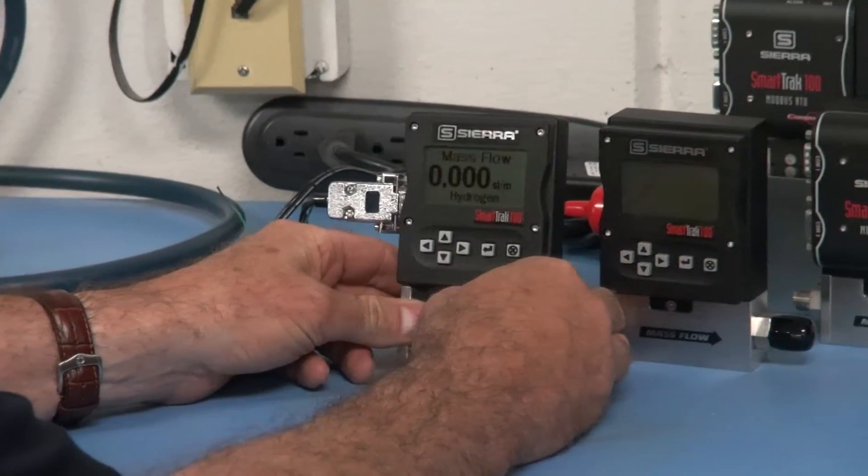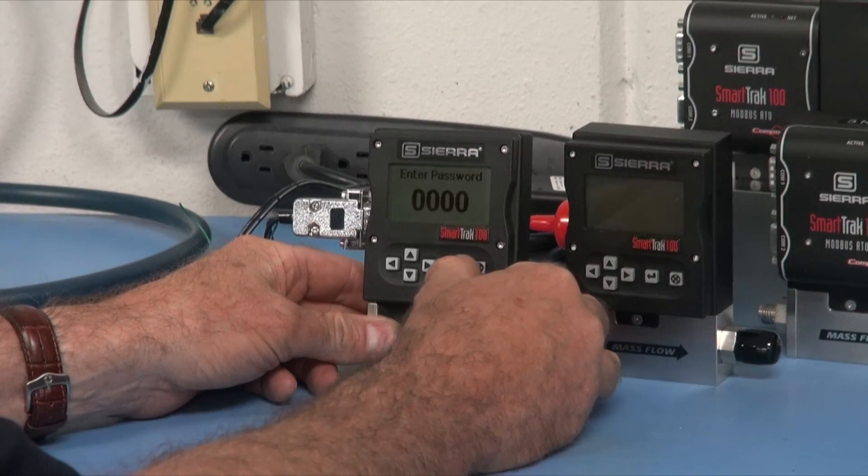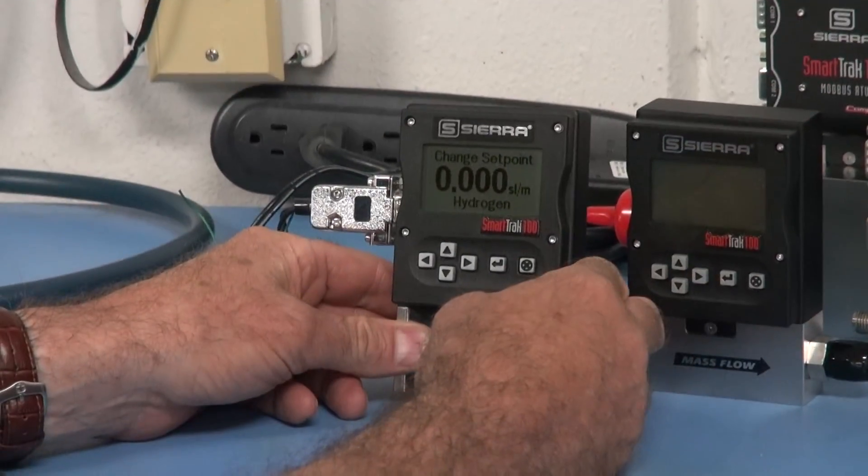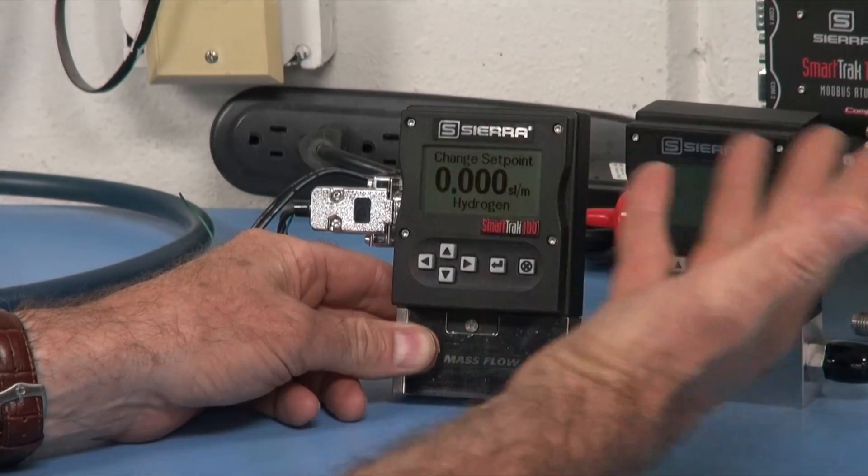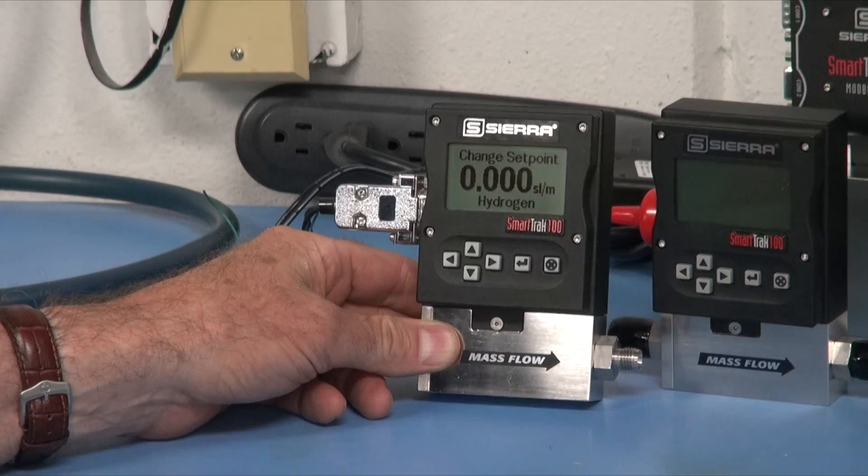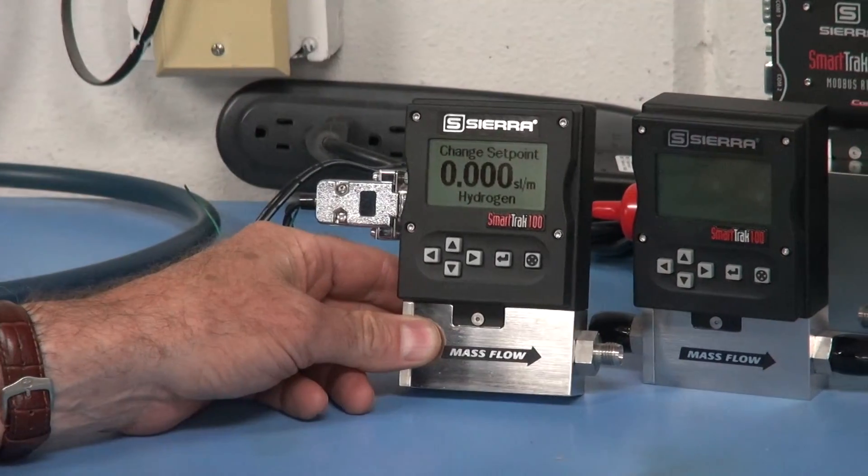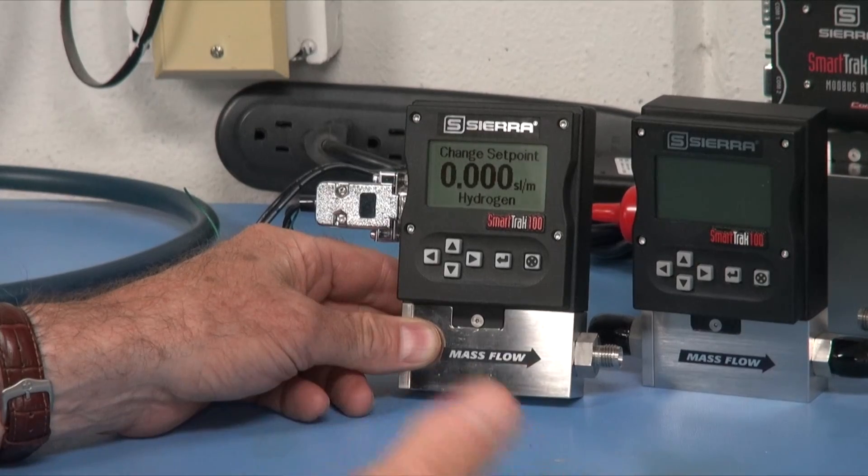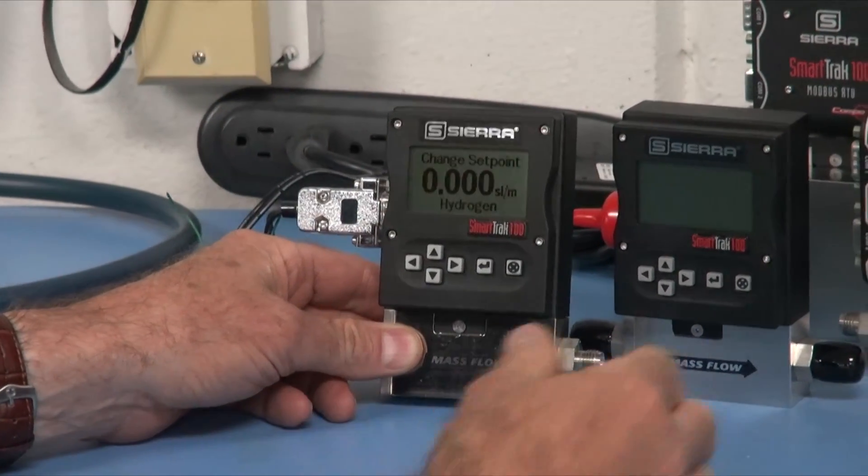So we press enter, ask for a password so it can be protected, and then we have change set point. When I want to set this up to flow two liters a minute or five liters a minute, I'll press enter and change the numbers on the screen. Then just press the button again, and away it goes to that flow rate immediately. Within a few seconds you're flowing exactly what you asked for.